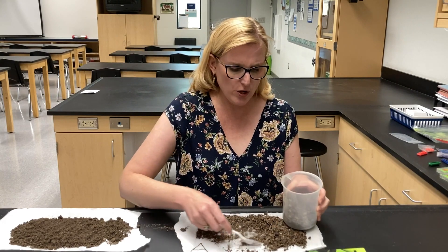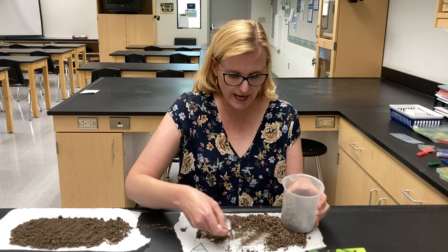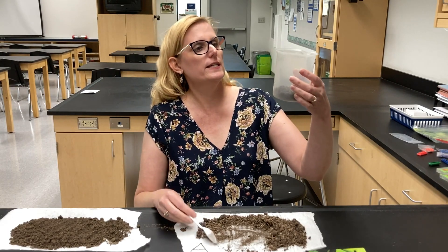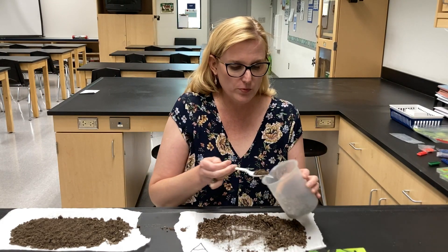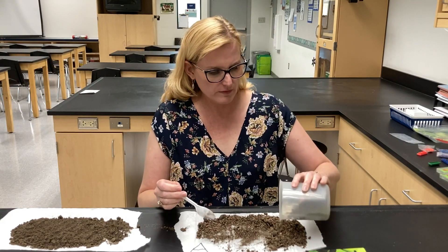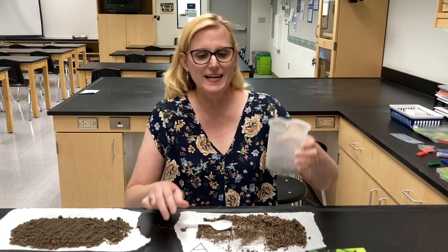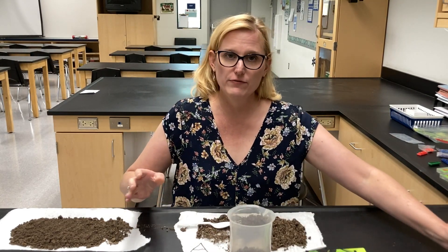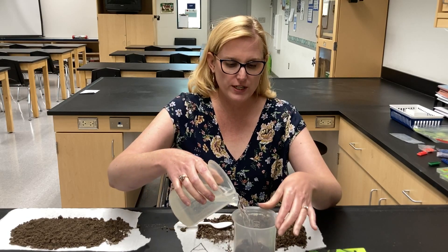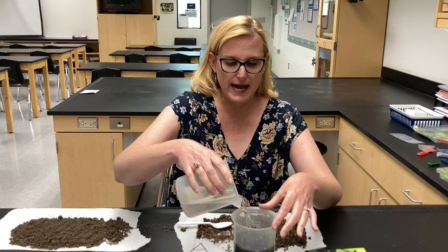They know people don't have scales at home to do it by weight, so we really do this more by volume than by grams. It's not particularly precise, but it is good enough to get our levels. We're going to test nitrogen, phosphorus, and potassium.